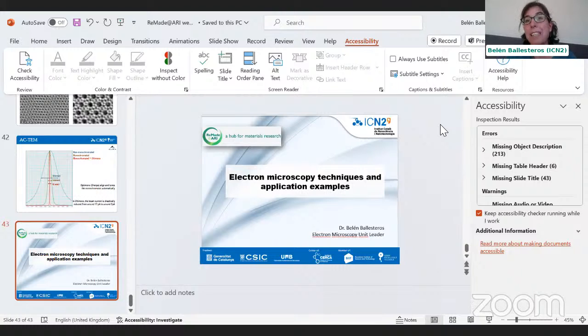But in the SEM, this is very important, because if you are interested in analyzing, for instance, the top layer in a sample, and this layer is, I don't know, 500 nanometers, and you send the electrons at, I don't know, 30 kV, you will also get information of the substrate.